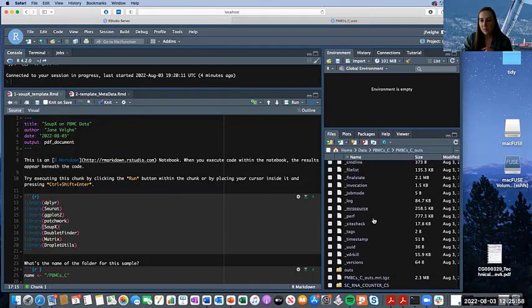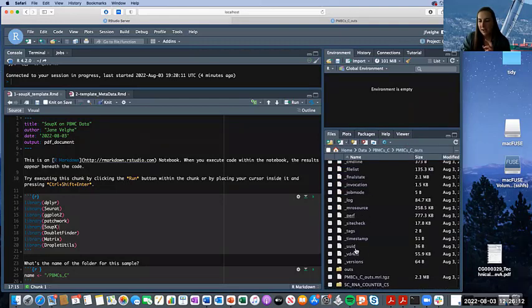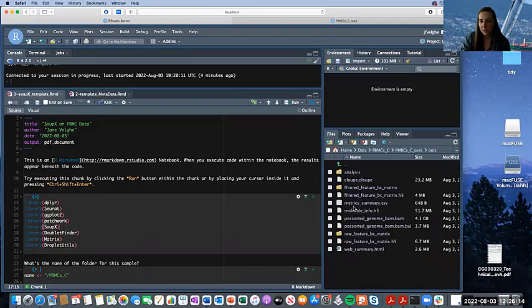Let's look at our outs from this morning. This is from our cell ranger outs. If you did not run cell ranger count from this morning, you're going to go to PBMC C and then into our output files folder. So PBMC C outs, you'll go into your outs folder down here, and then these are the outputs that we got from cell ranger count.